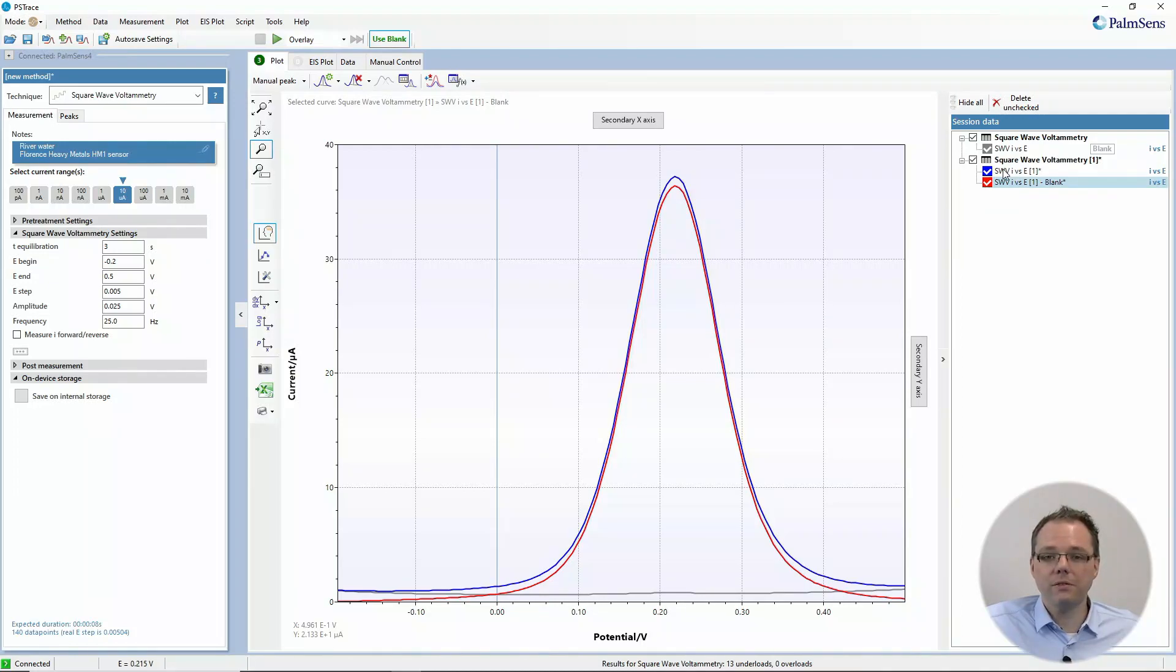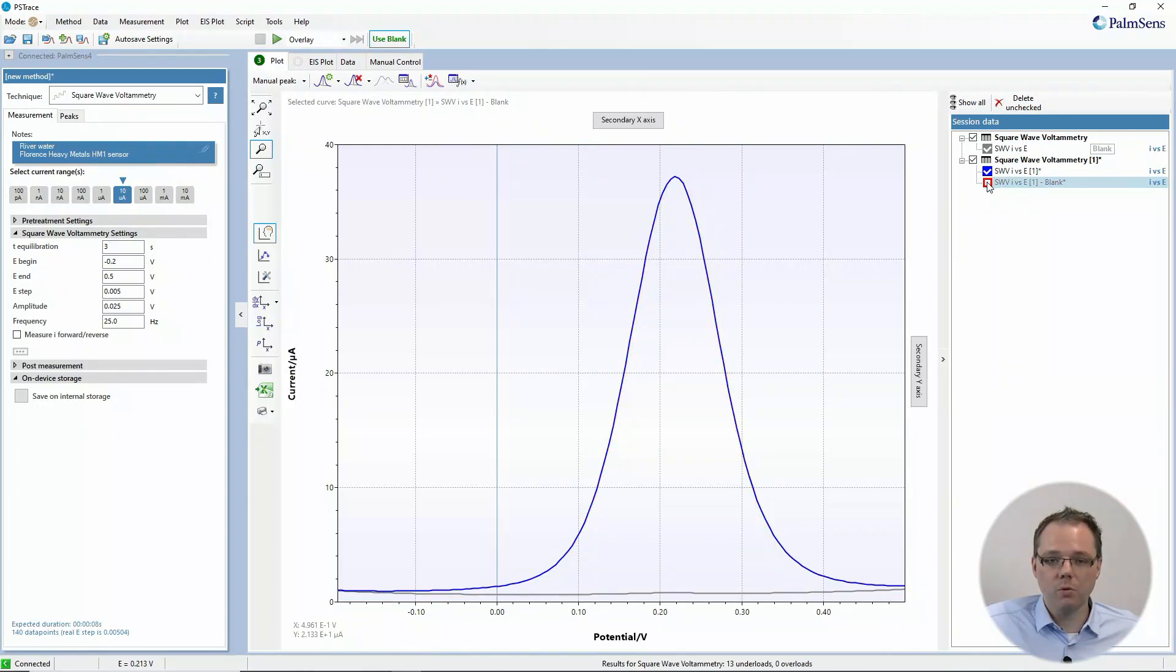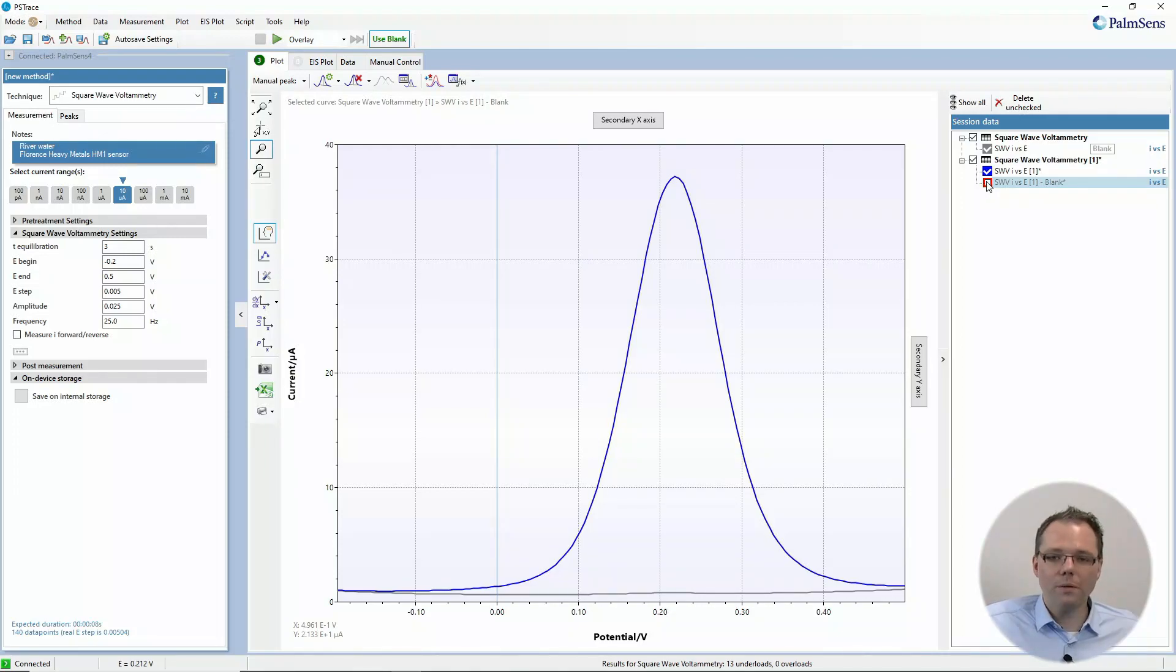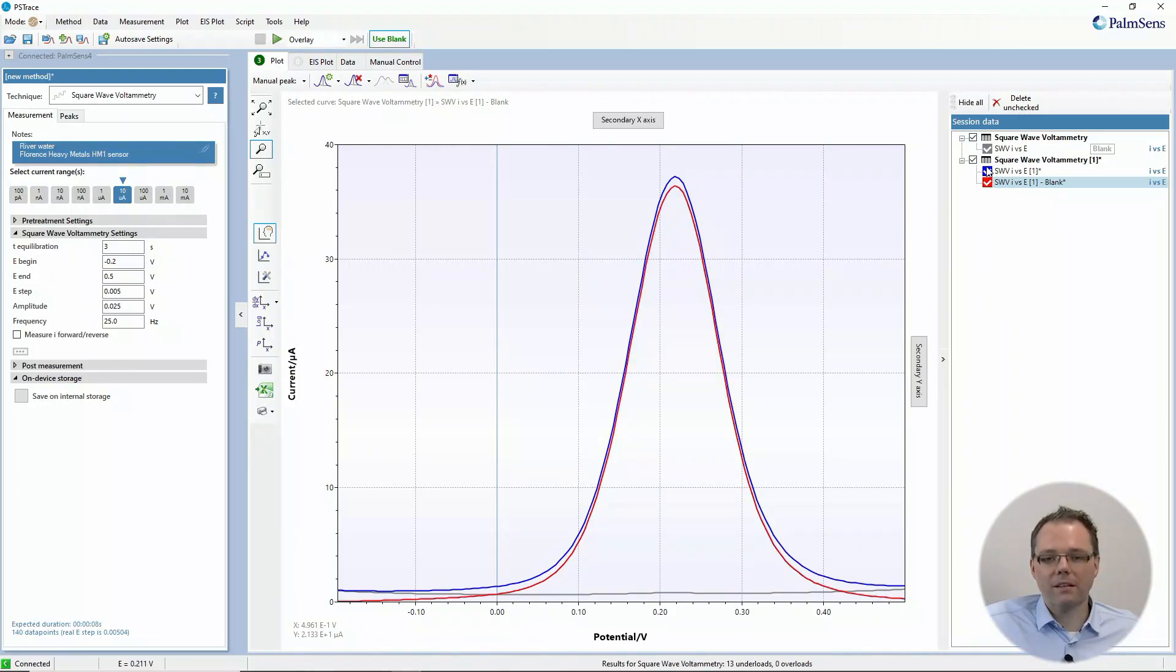You see the measurement that was actually measured, which is the blue one, and then you see the result of the blank subtraction, the red curve. I've chosen an experiment where the difference is not super extreme.